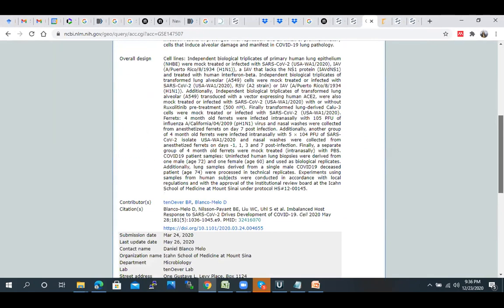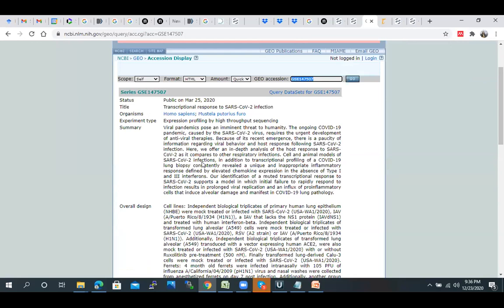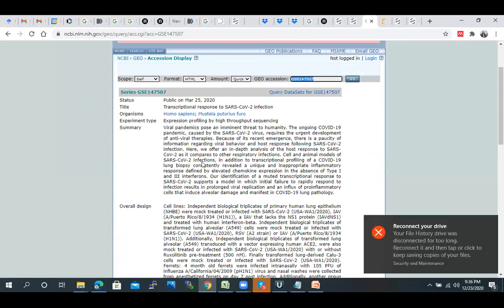So how do you know exactly which paper or which study is associated under these citations? Here you will get the complete publication, the research article that is associated with this data set, and you can go through exactly what the authors have done and what we can still do with this data. Then under the summary, they usually provide complete information, summarizing what they have done.